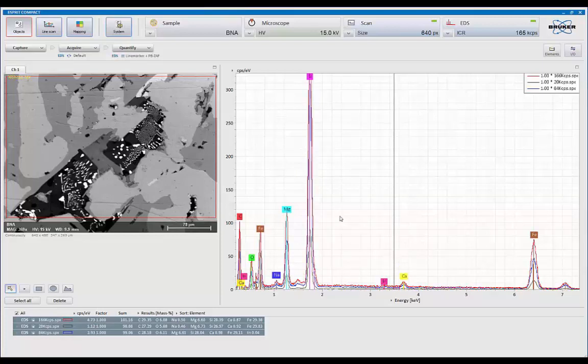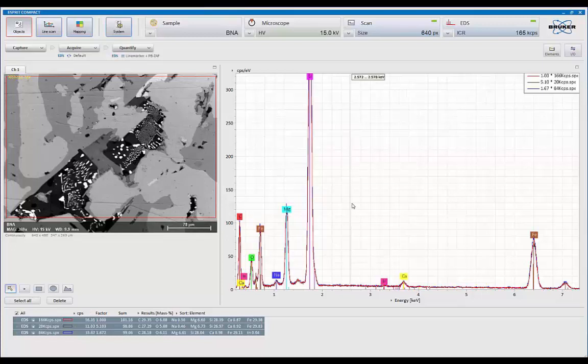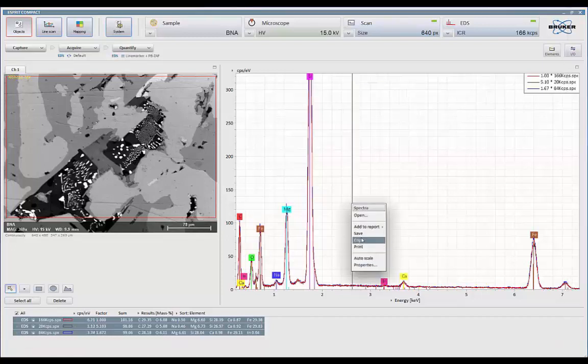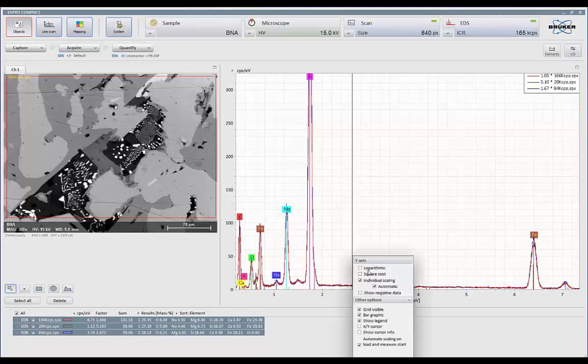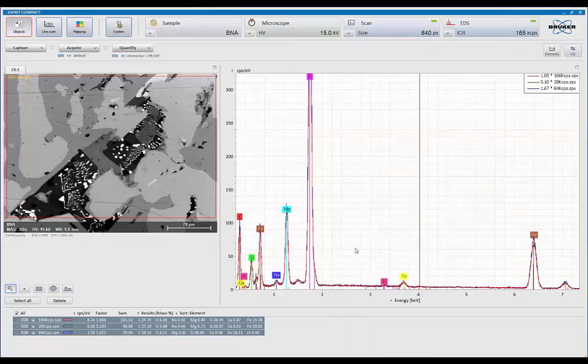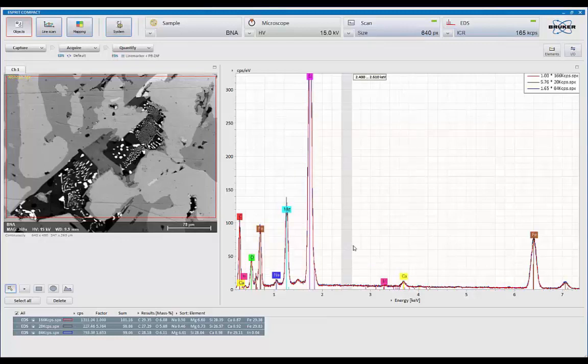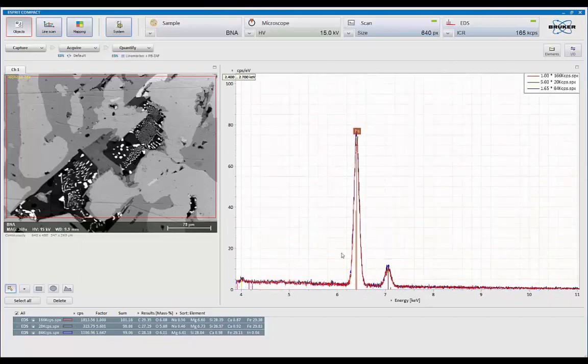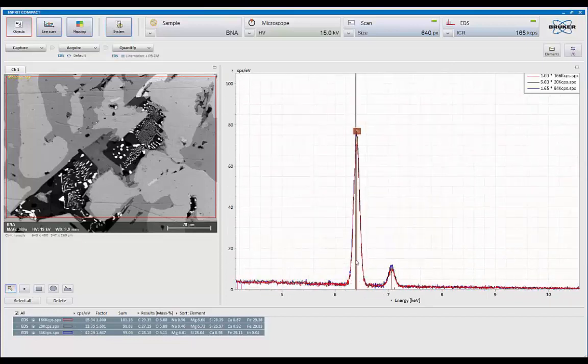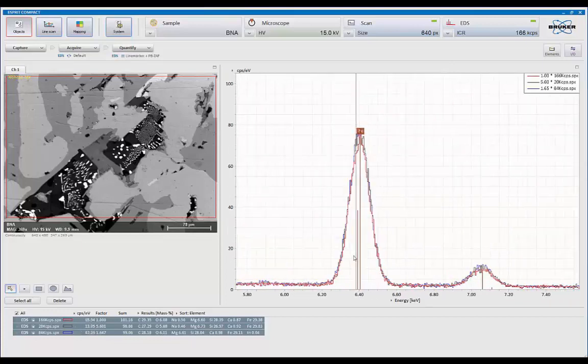I'm going to scale them to a common background point. So one of the features we have is the ability of scaling data under properties. This is where you can go to choose log, scale, square root, but also dynamic scaling. And then using the right mouse button, you can choose an area that you want to scale it to. And what we want to look at now are the three spectrum overlaid.